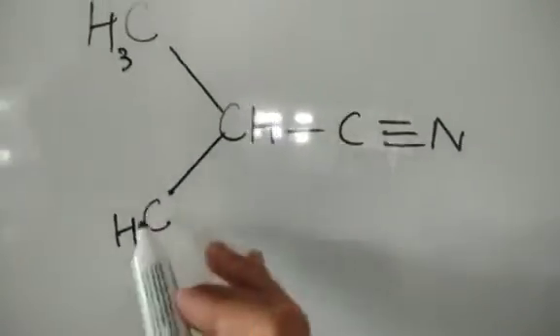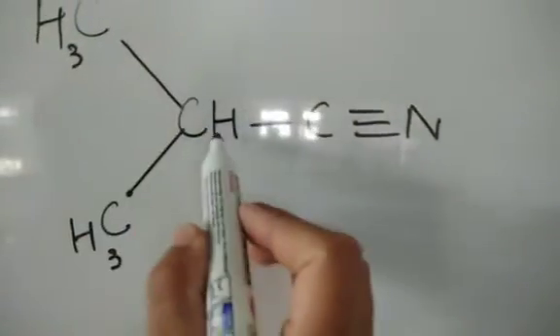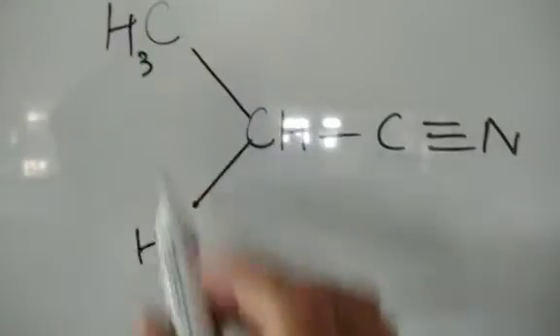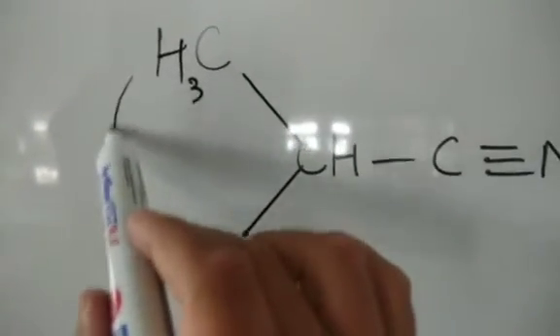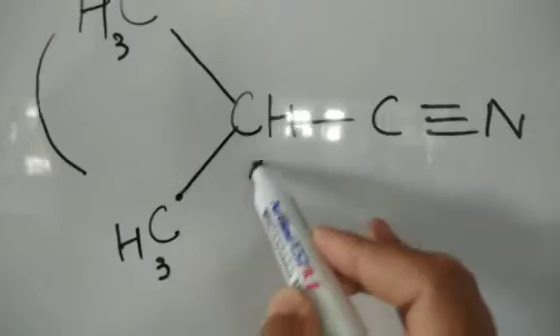अब यहाँ प्रोटॉन है, यहाँ प्रोटॉन्स. अब ये कार्बन, this CH3 is attached to this carbon. This CH3 is attached to this carbon. So that means these are equivalent carbons. So इनकी वजह से that's one peak. Now this is hydrogenated this carbon. This is second peak और कोई नहीं. So we have 2 signals here.